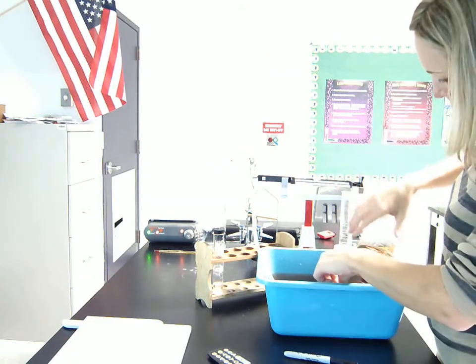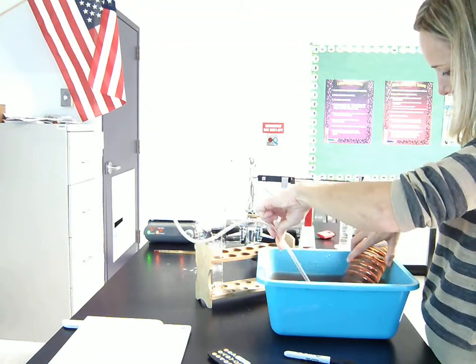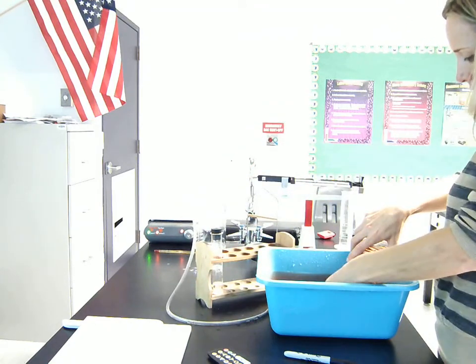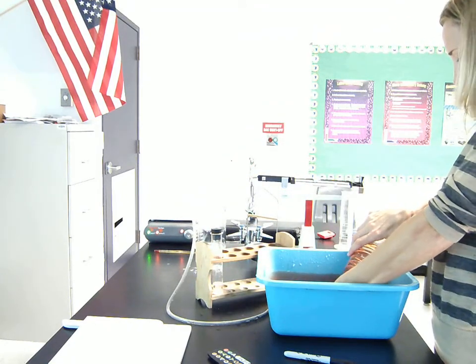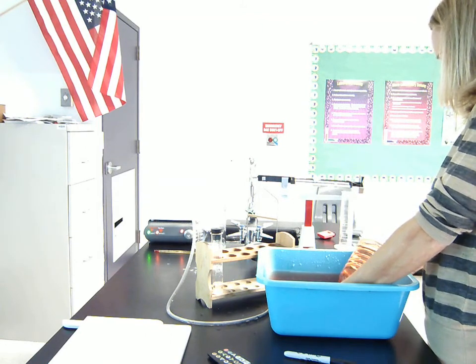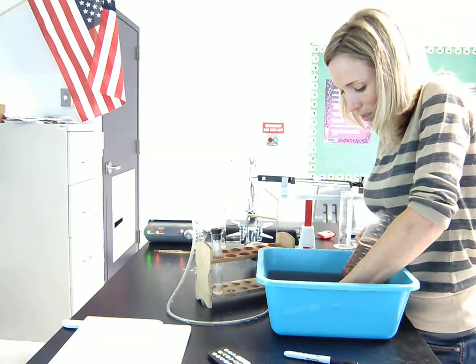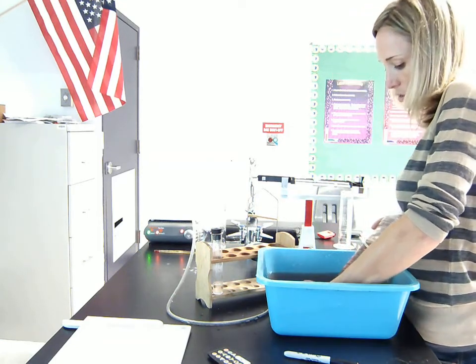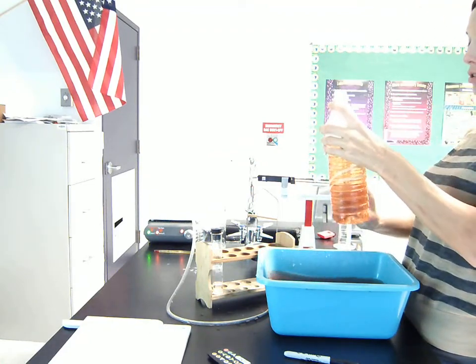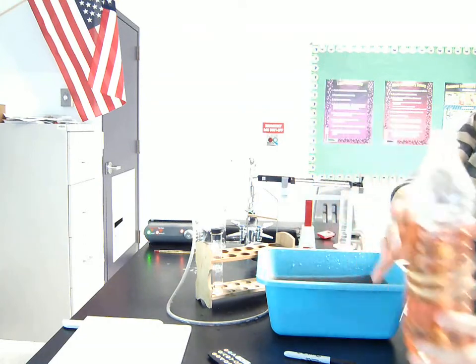So we want to very carefully remove the delivery tube first, out of here. And we don't want to let any of the water out of the bottle, because that would be misleading in terms of our final results. We want to know exactly how much is left, so that we know exactly how much was pushed out of the bottle, so that we know exactly how much gas was produced. So here's how much is left.